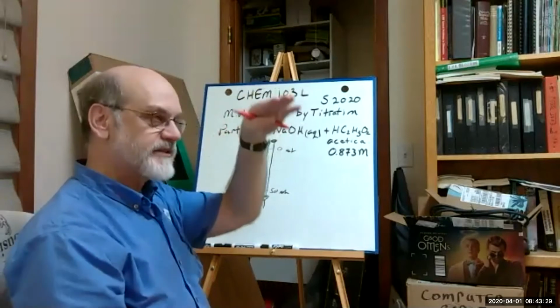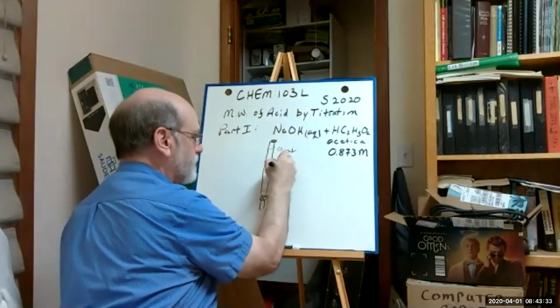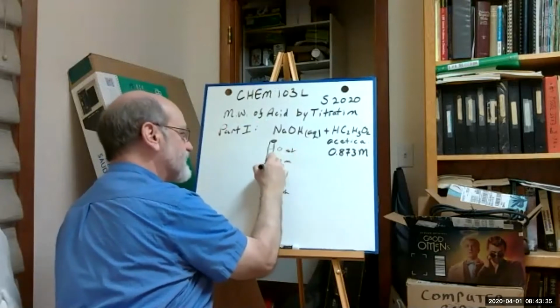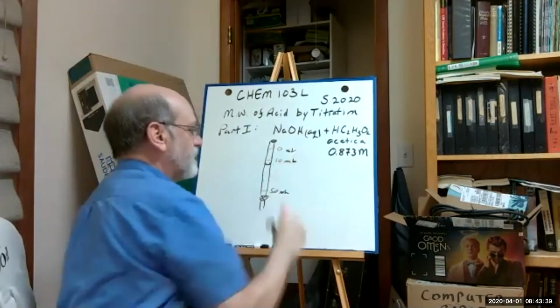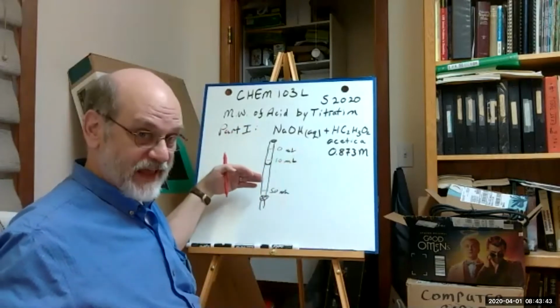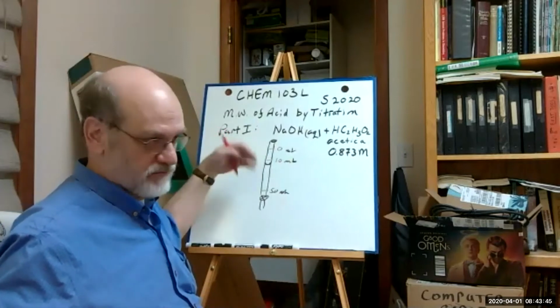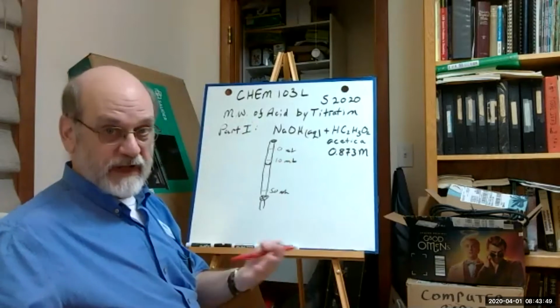And if you go past a value, say if you're down here around 10, but your meniscus is here, it's not 9, but it's greater than 10. So it's 10 point something. That's the first trick in reading a burette.